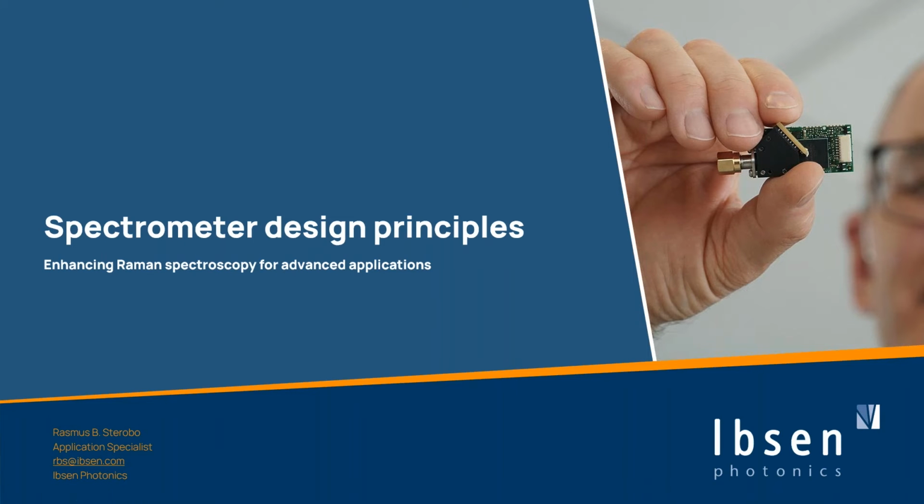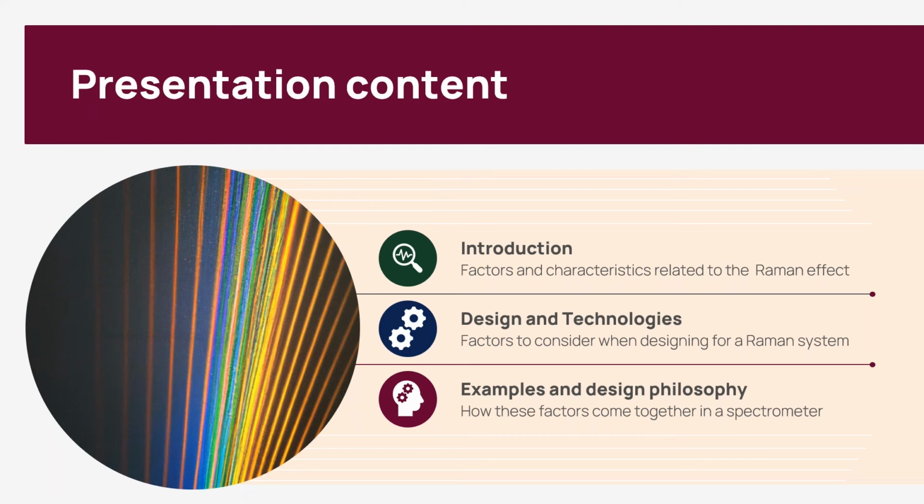Yeah, thanks for having me on. As mentioned, today we'll be looking at spectrometer design principles, mainly focusing on Raman spectroscopy as the main application. But of course, most of these things are applicable to more than one discipline. My name is Rasmus, and I will be presenting for you today.